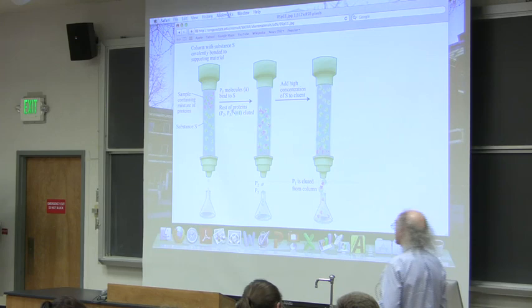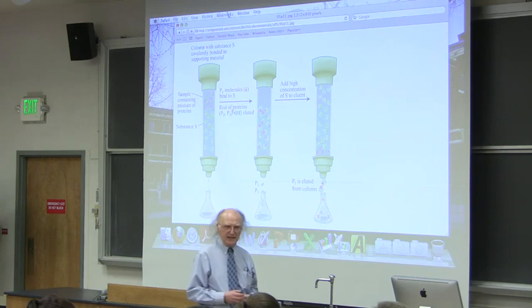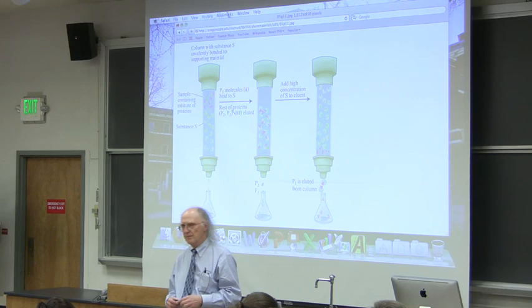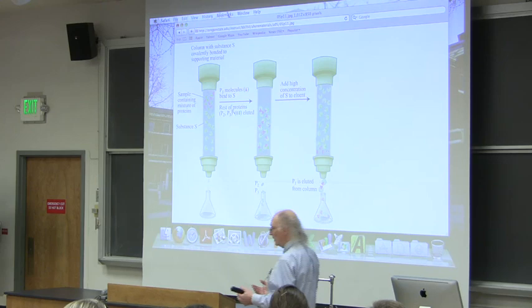Affinity chromatography uses some characteristics of the specific protein that we're after as a tool for isolating it. How does it work? Okay. Well, let's say that I'm doing some research and I know the protein that I want to purify binds to ATP. I know it binds to ATP. Okay. That's the only thing I know about it, but I know it binds to ATP. Is there something I can do, I can use of that information to isolate my protein? And it turns out there is.